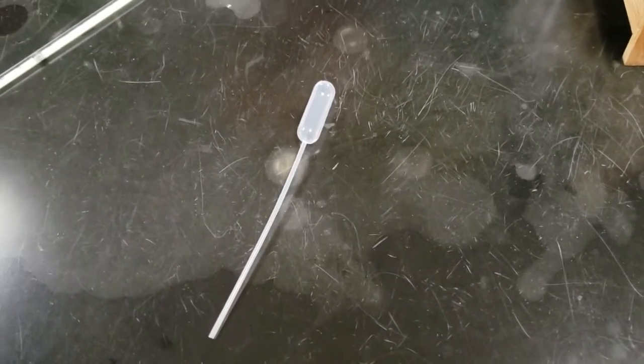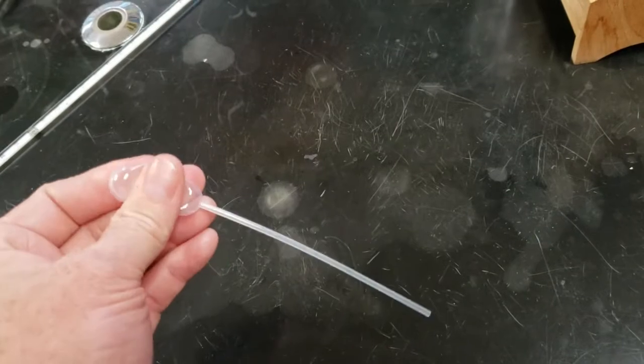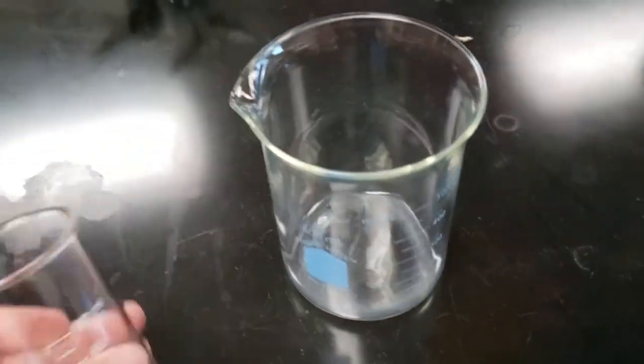Not a big deal. This is a disposable pipette. It's good for sucking up little liquids and dropping them off. They're very useful. They don't measure anything, but they're good for transferring. Here's a test tube rack with a bunch of test tubes. Over here are some beakers.